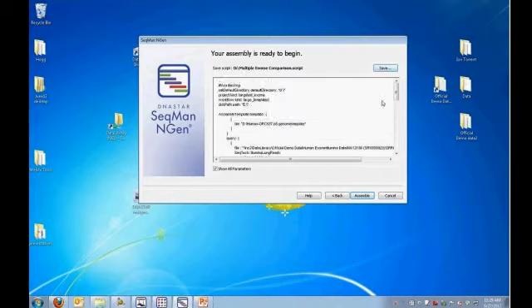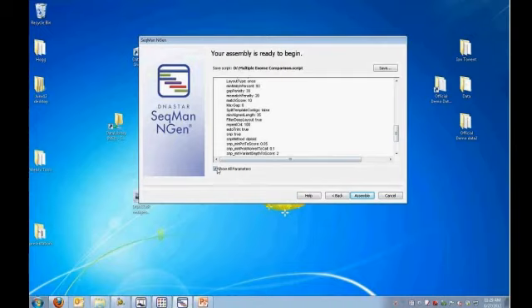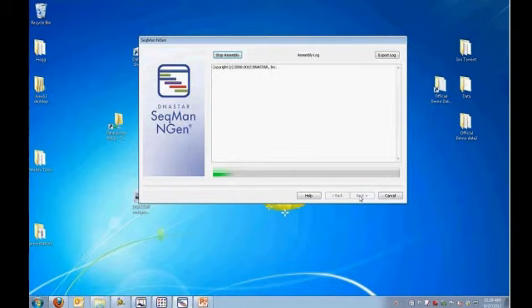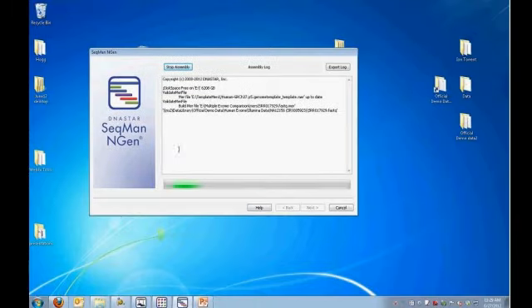There's also some additional parameters here that are actually used by the assembler. And when I click Assemble, it's going to automatically save the script, and the assembly will begin. And I always want to watch here. It tells me how much free space I have. I've got 6 terabytes on this computer. If my disks aren't awake, sometimes my hard drives are in a semi-dormant state, especially the first thing in the morning, and I might get an error right away that says disk not available. And sometimes it's just a matter of waking it up a little bit, and we're good to go.